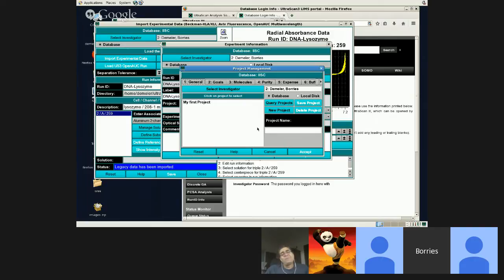And then I go in there and think, oh my God, well, fortunately I have this project. The notebook is directly associated with my data and has all the details and information that I need in order to write the paper. So always keep that. You can make a new project by clicking here, New Project, and then giving it a name.